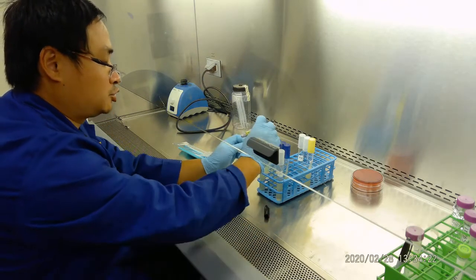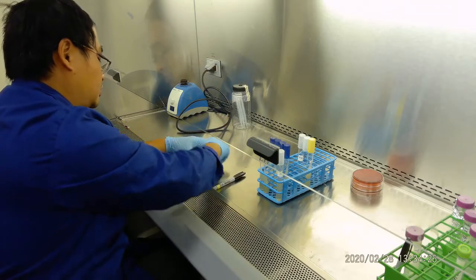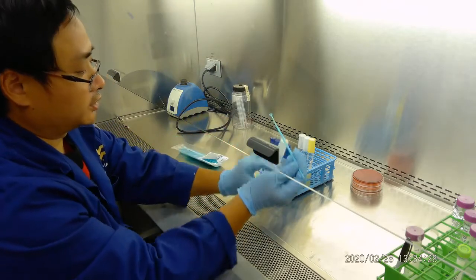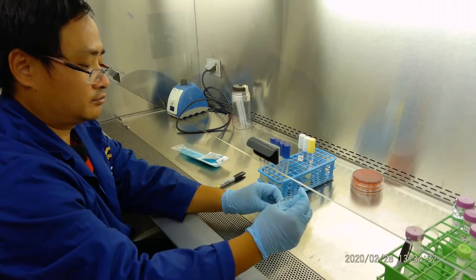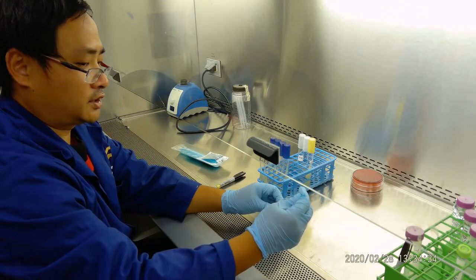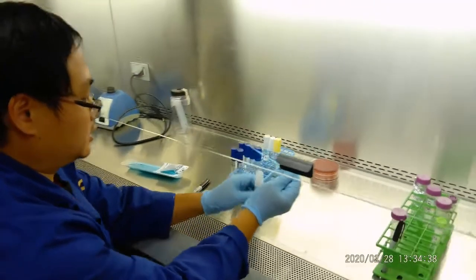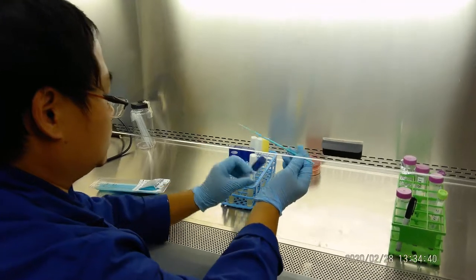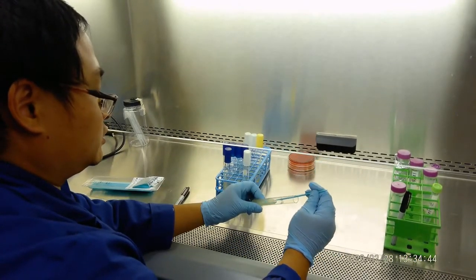So we do a streak plating. That's very simple to do. You get a loop and pick Serratia. Take a picture like that. Serratia, and then we streak it. That's what we do, a zigzag streak. Will you take a picture? We do a zigzag streak.